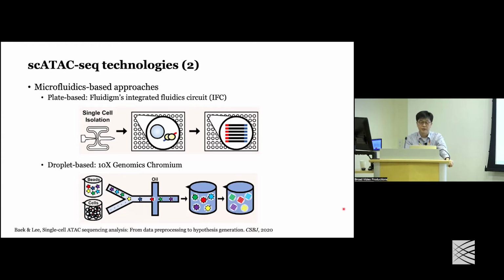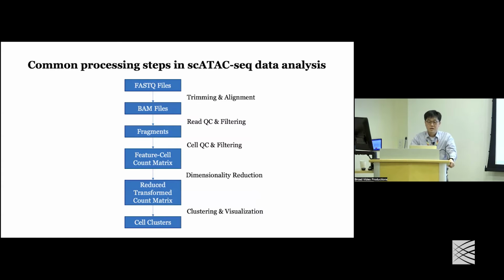So this provides a reasonably good sensitivity, and also reasonably high throughput. So this 10x Genomics platform has become one of the most popular assays these days. All right.